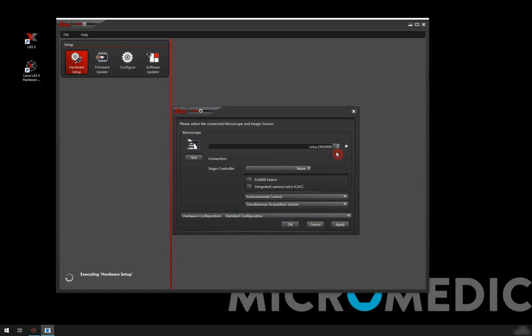At this point we could be done, but the only thing to consider is if we have, for example, an integrated camera.